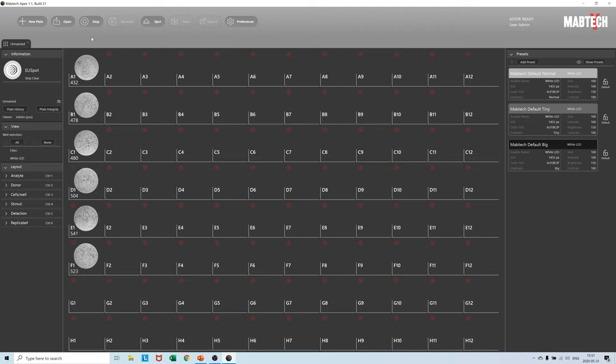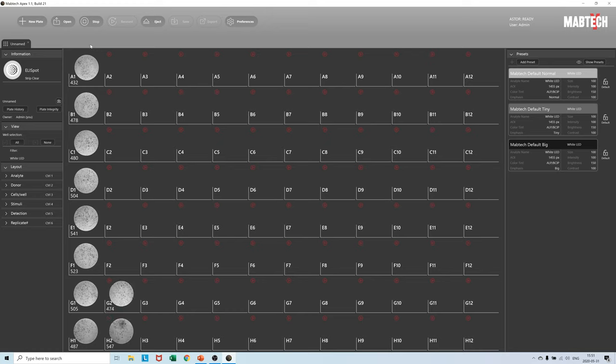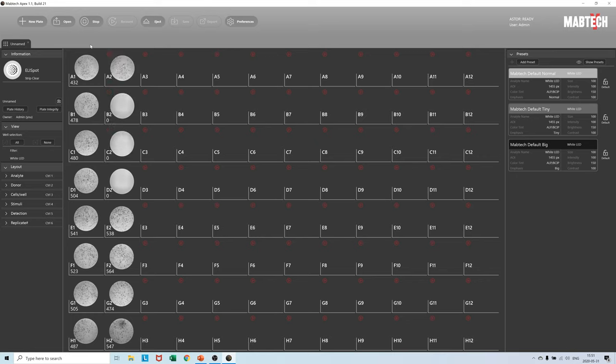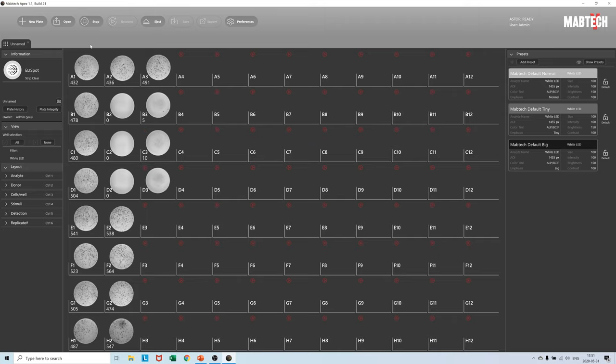Every single image from the Elispot plate is captured in 12-bit image raw. The exposure settings have been calibrated individually by us at Mabtech headquarters prior to shipping each Astar unit. As a result you get unbiased capturing of Elispot images.